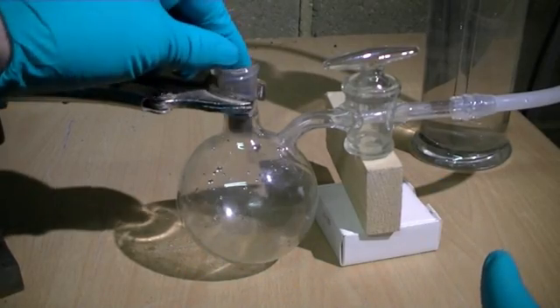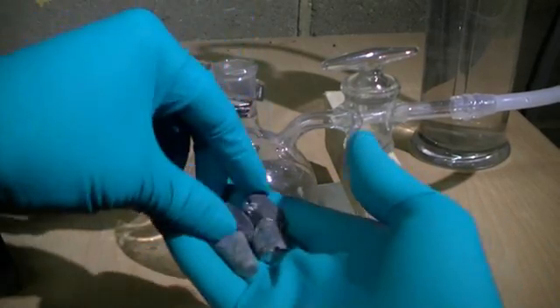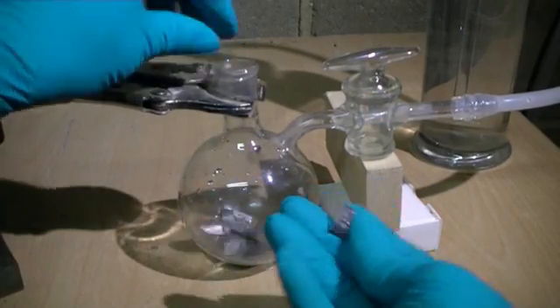Now we add our chopped up pieces of zinc to our reaction vessel. The reaction vessel is connected using some rubber tubing to a gas bubbler, as we expect some gas to be produced when zinc metal reacts with sulfuric acid.